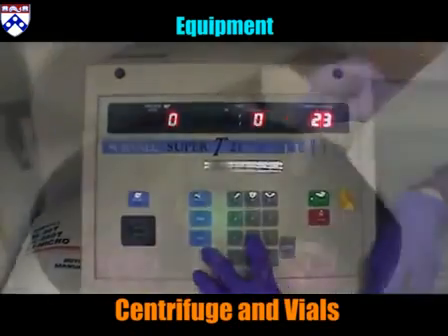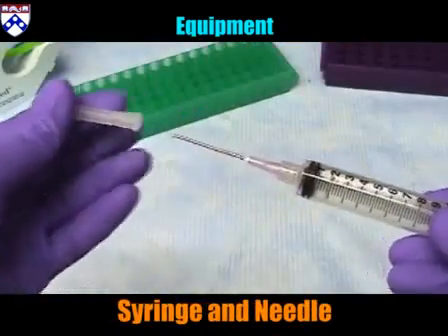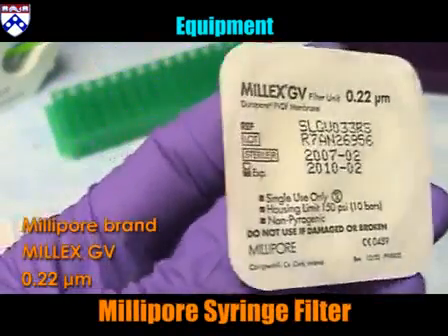Equipment: centrifuge and vials, vortexer, needle and syringe, syringe filter — Millipore brand Millex GV, 0.22 micrometer.